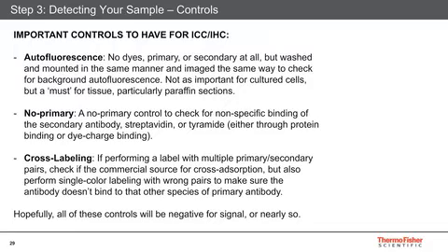And then finally, if you're doing multiple antibodies in your section or on your cells, make sure that you use cross-labeling controls. This is where you use the wrong secondary on purpose in a single color experiment. So if you have a mouse and rabbit primary on your sample, then you'll do a control with just the mouse primary and just the anti-rabbit secondary. And hopefully you won't see any binding.